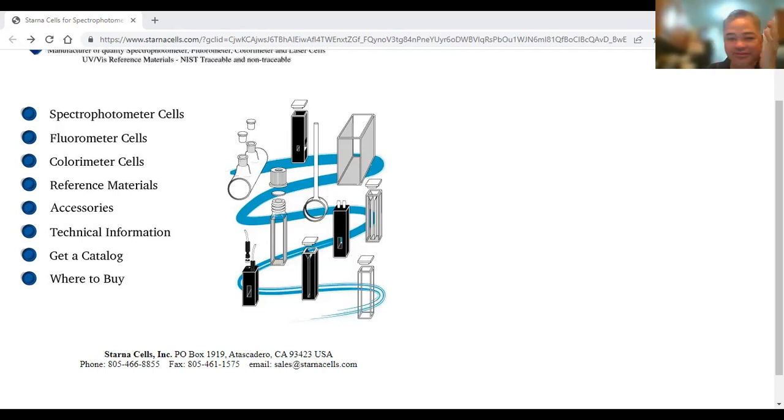So maybe we can just go through some of them. One is the photovoltaic cell. Usually it's just part of the instrument. Light of sufficiently high energy passes through the thin transparent silver layer and hits selenium, causing electrons to be released, which move across the barrier towards the silver layer, electropositive, and are collected at the iron layer to neutralize the selenium layer. The current produced is proportional to the photons hitting the surface. The maximum response is at 550 nanometers. Advantages: cheap, rugged, no external power source, good for portable instruments.